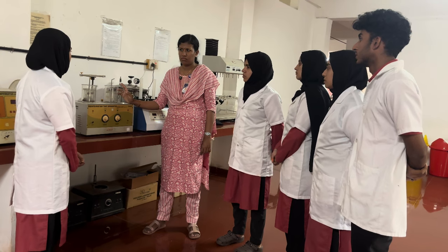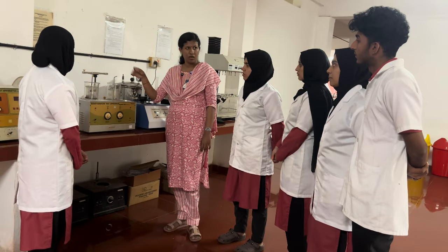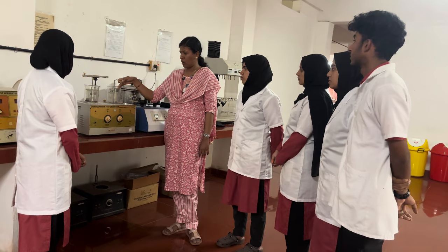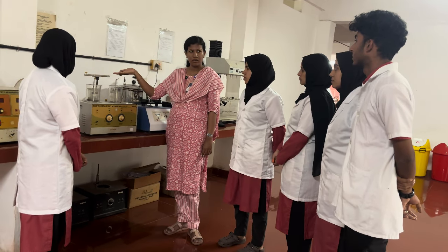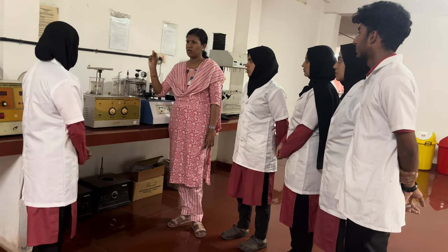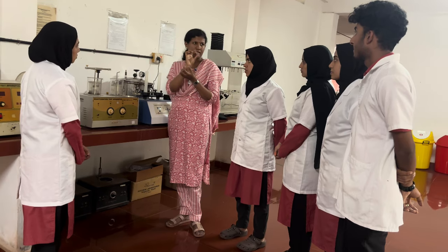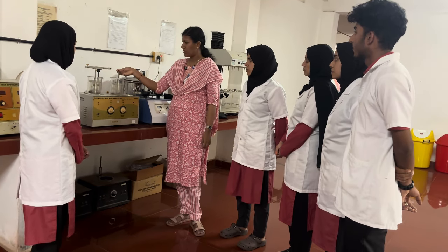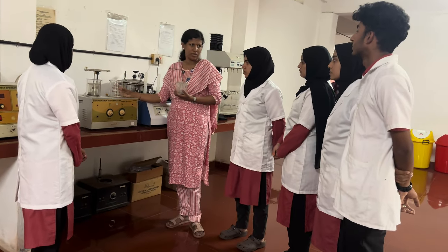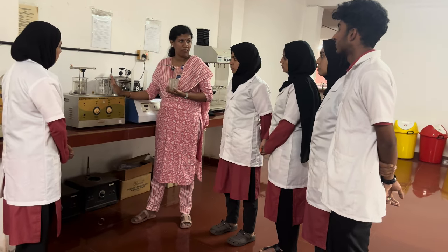The plastic disc is used in order to prevent floating. There is a chance that if the tube is filled with water, the tablet can float out of the tube. So in order to prevent that floating, we are adding the plastic disc. You can see there are holes in the plastic disc. Okay. So next, we have a beaker of 1 liter capacity, and we have to fill this beaker. How much volume do we have to fill in this beaker?